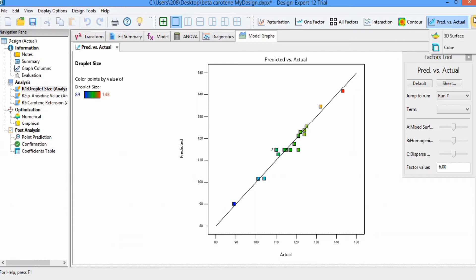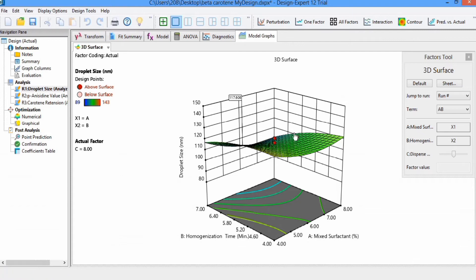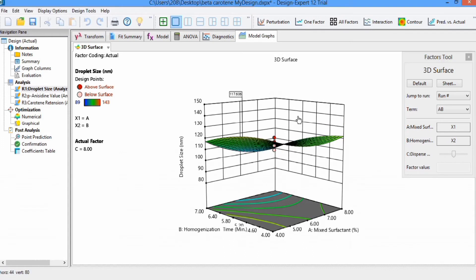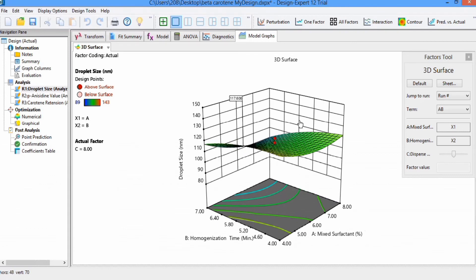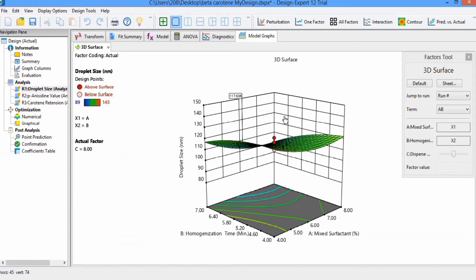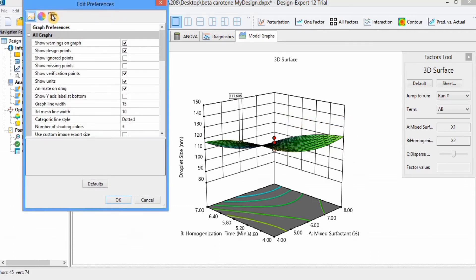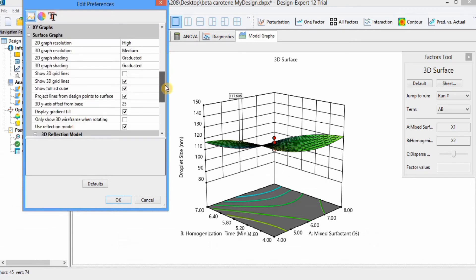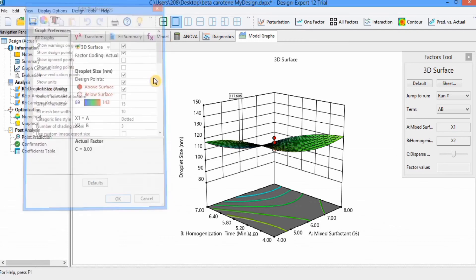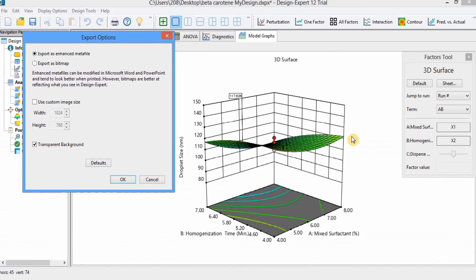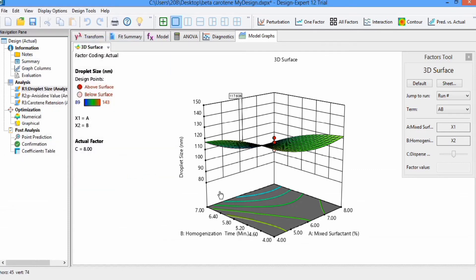There is an option of 3D Surface. You can see this graph appears here and you can change the terms from here. You can move this graph by exploring this option and change it in any direction. As discussed with the contour graphs, you can find plenty of options by applying Graph Preferences, such as text, color, and different styling options. You can explore these options to make the graph more attractive. You can also export this graph to a Word file by going to Export and selecting Export Graph to Word.